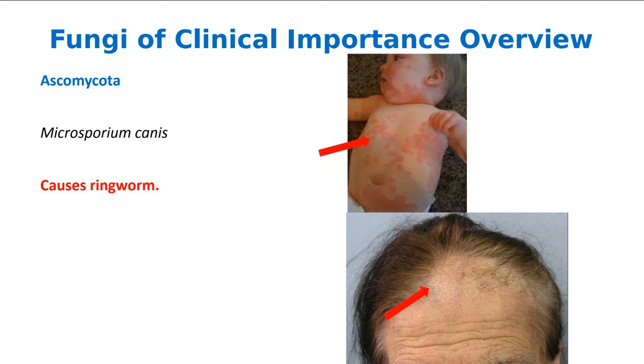So you have mycelium. Oh, let me draw it. You have mycelia, and then it gives rise to a single spore that looks like a leaf. Okay?